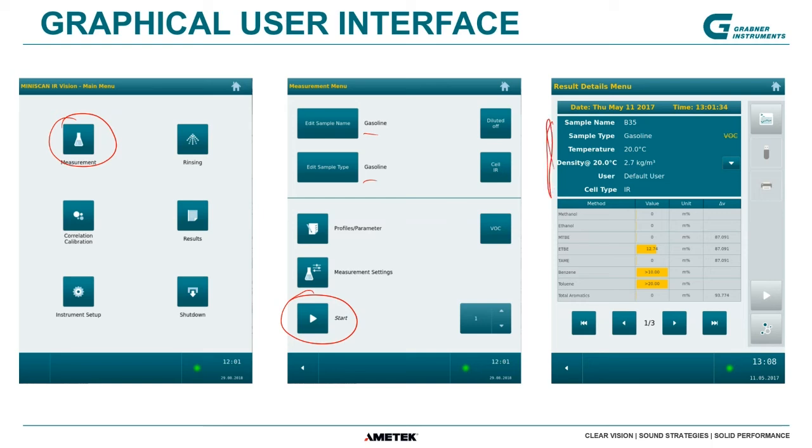The results have a header section where you have, for example, the typical features of the sample, like the density as well, and some other parameters that have been chosen, and then a list of the results which are given here. These yellow bars, which you see also overlaying some of the results, are giving you the typical range. So it gives you a good indication if you are out of range or within the typical range. And you can, of course, flexibly set this.